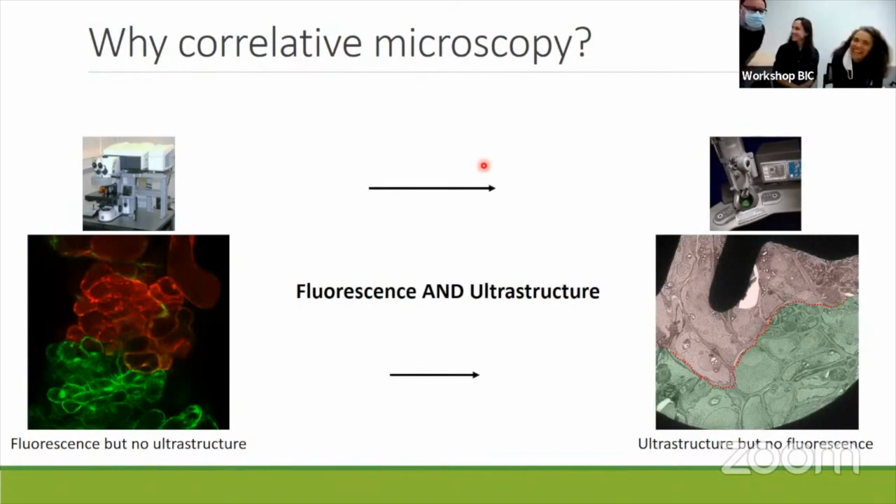Now you can see the second sticker. Okay, so where I was. So the idea is to combine the two techniques to get advantage of both of them and find the graft interface, and then study the ultrastructure and ultrastructural events ongoing at the graft interface.